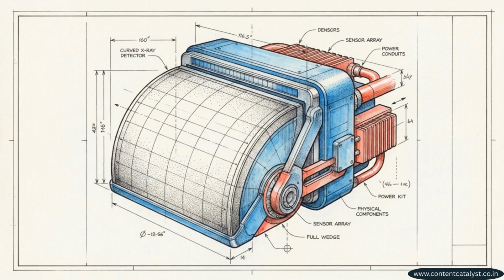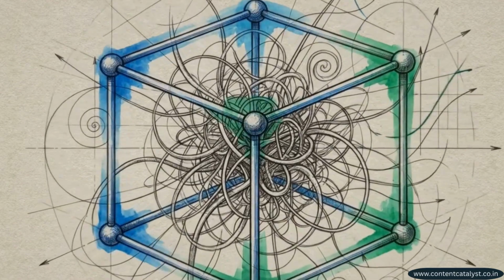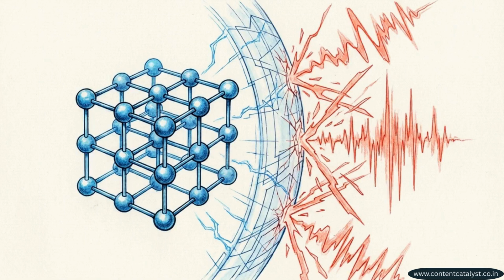Establishing this realistic baseline restricts the algorithm. It removes the mathematical temptation for the software to invent false microstructural parameters to explain a simple hardware footprint. An accurate instrument model acts as a structural firewall. It guarantees the physical insights you publish belong to the material, not your detector.